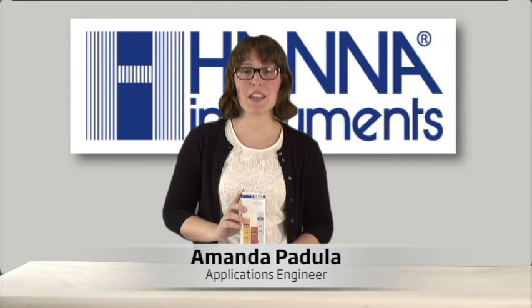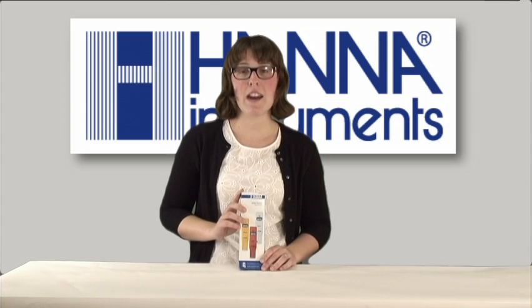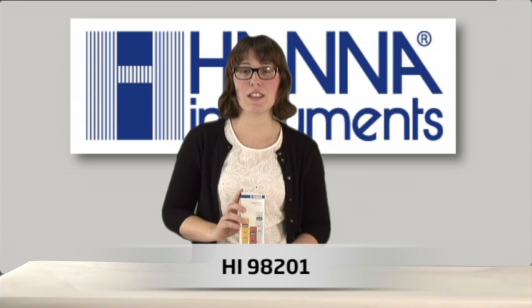Hi, I'm Amanda Padula and I'm an applications engineer here at Hanna Instruments. Today I'm going to demonstrate how to operate the HI-98201 pocket-sized ORP meter.